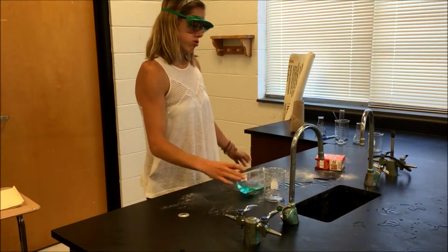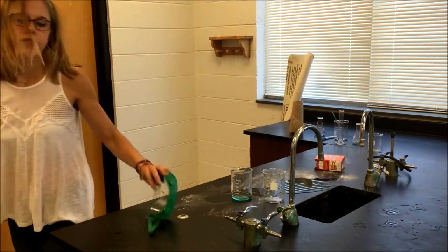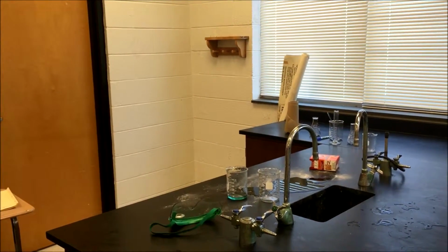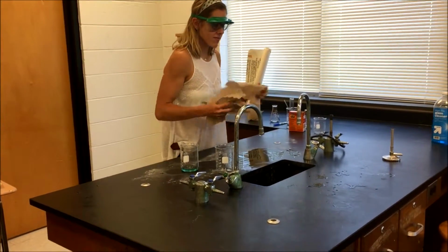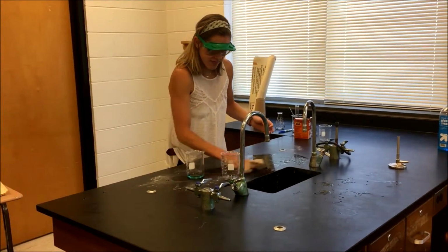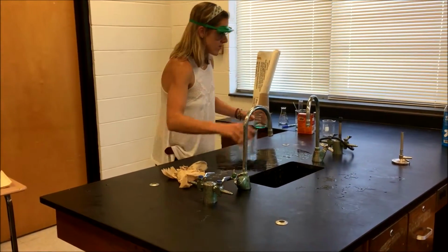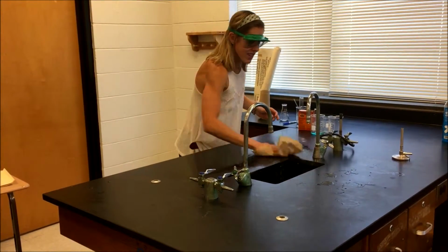Here we see the chemist spill her chemicals on her station and very rudely walk away. Where are your manners? But here, we see the chemist has a messy station and properly cleans it up before exiting the lab. Look at that chemical wiping form. Always make sure your station is clean and wiped down before exiting the lab.